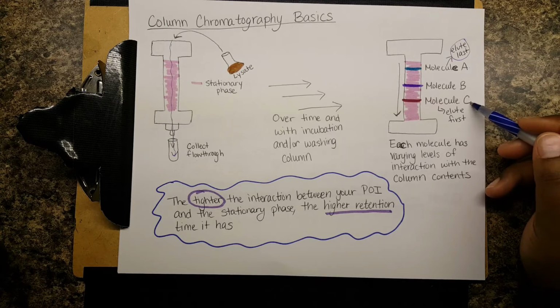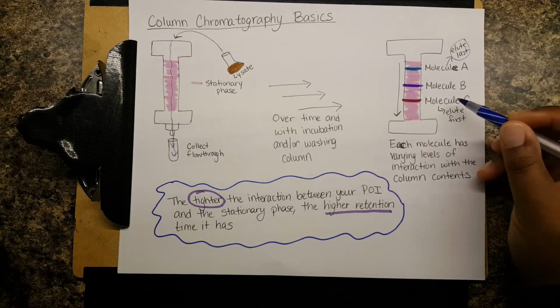Anyway, molecule C is like, look, I have social anxiety. We should be socially distancing ourselves. I'm getting out of here. So it will elute first.